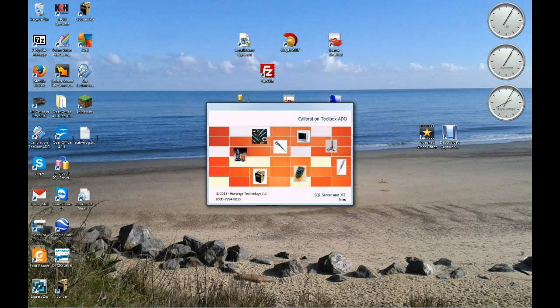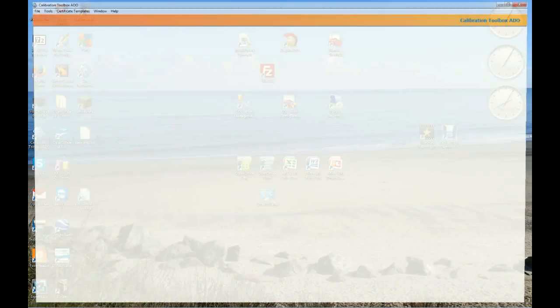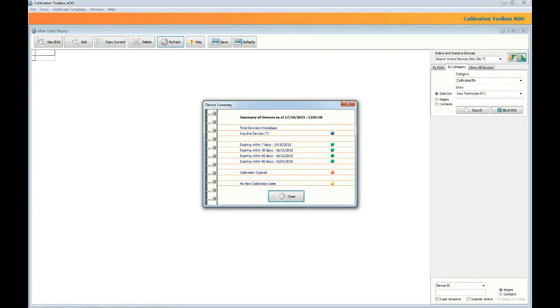So what we're going to do is run Calibration Toolbox ADO and login with our unique username and password. Your System Administrator will provide these for you and you can change the password whenever you like.